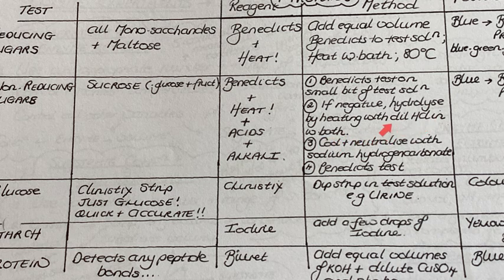It's very important that you say dilute hydrochloric acid because concentrated hydrochloric acid you would not heat in a water bath. That would be very dangerous. Remember to say also that you would wear safety goggles. So when you heat sucrose with dilute hydrochloric acid in a water bath, it breaks down into glucose and fructose. But after you've done that, the solution will be really acidic, and that would mess with the Benedict's test. So you need to neutralize that solution.